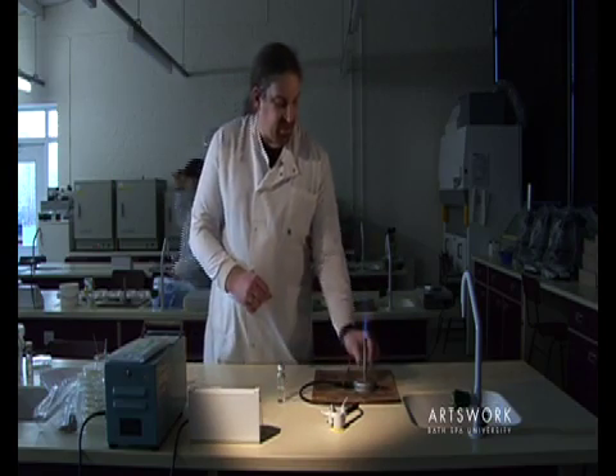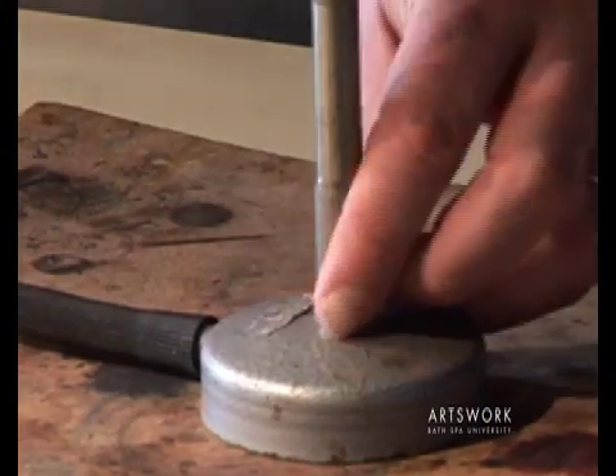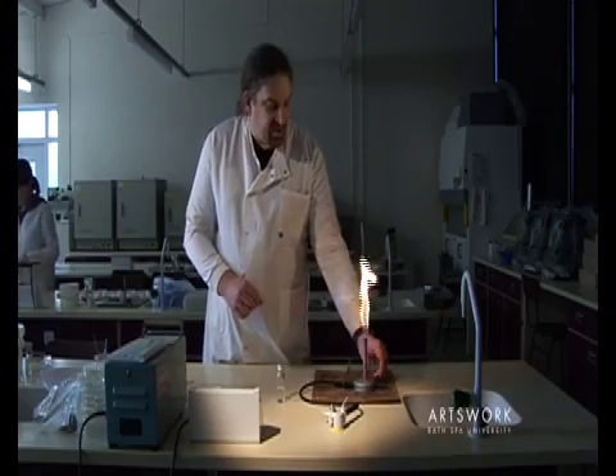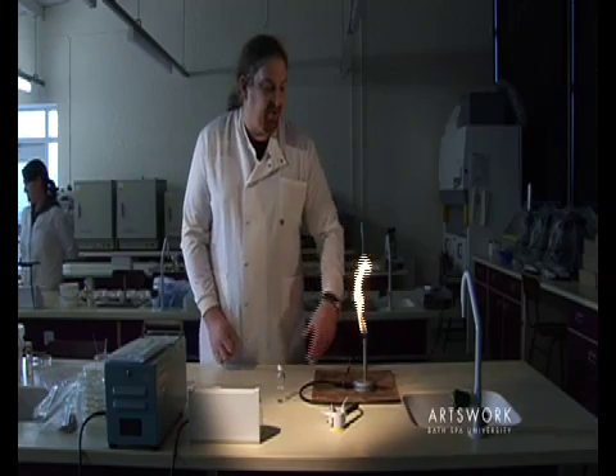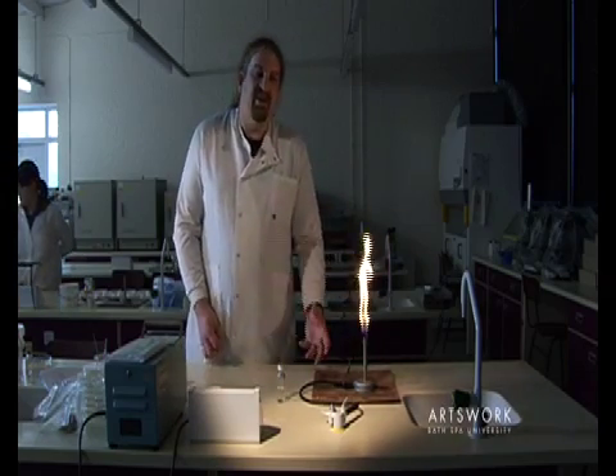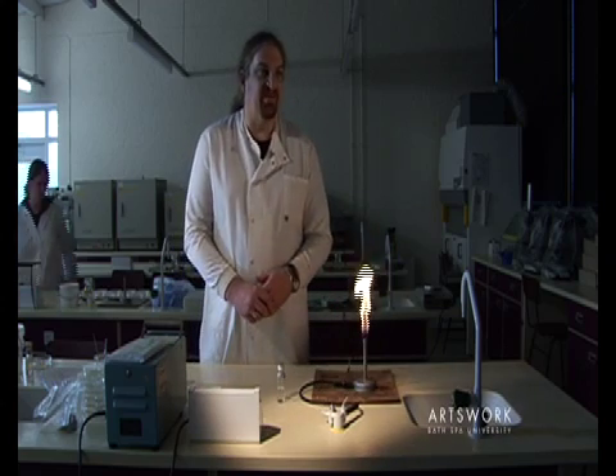Once you've finished your work, turn it back onto the blue flame. Always be careful when using the Bunsen on the blue flame — don't lean across the flame, particularly if you've got any loose clothing, or if you've got long hair, keep it tied back.